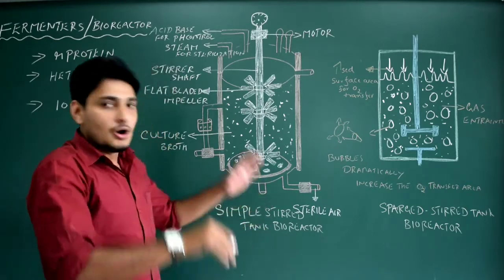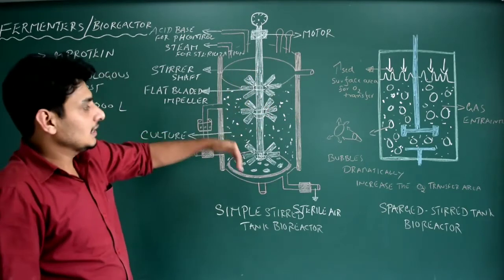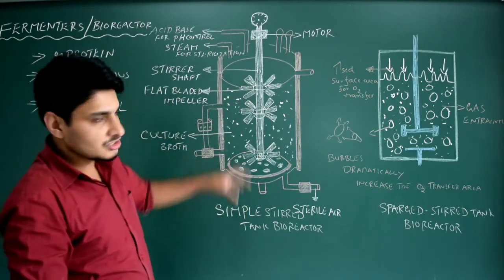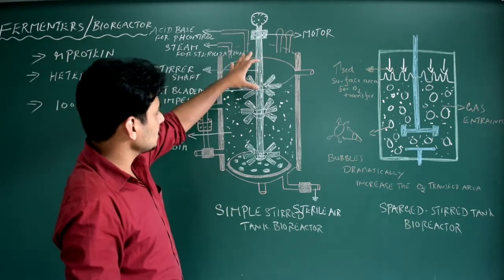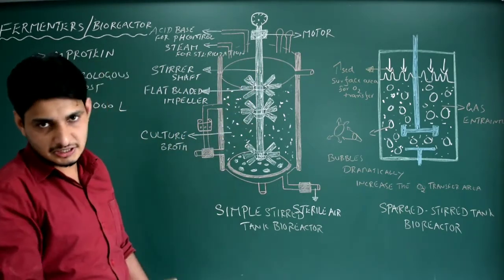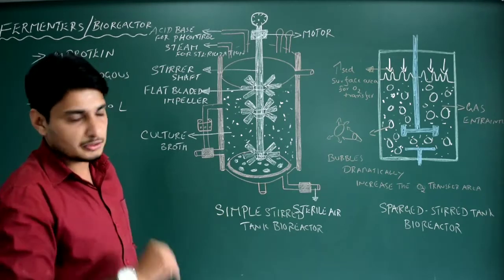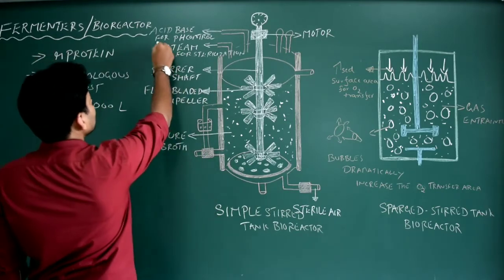Why are these bioreactors or fermenters preferred for the culturing of this heterologous host organism? Because you could see in this picture, I have a request. I have already drawn this diagram before the session itself, because it takes a lot of time. You can pause the video, or maybe you can find the same diagram in your NCERT also. I have not made any changes in the diagram, as it is drawn according to NCERT, because it is asked in competitive examinations. So just take the diagram.